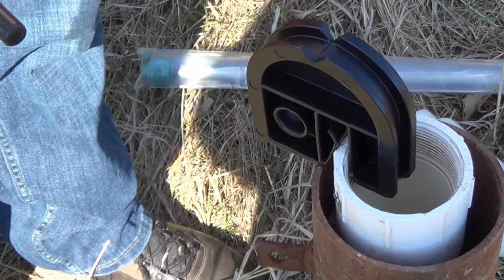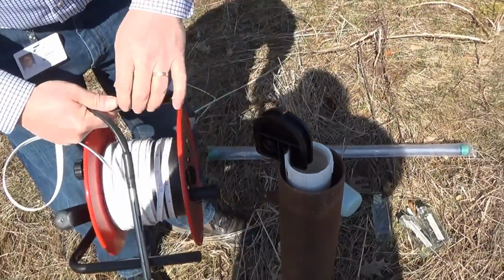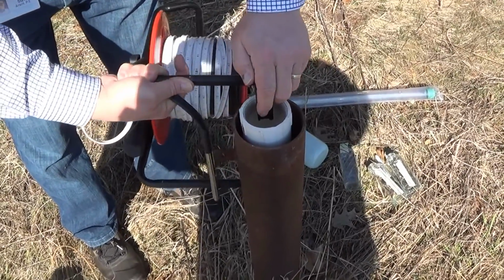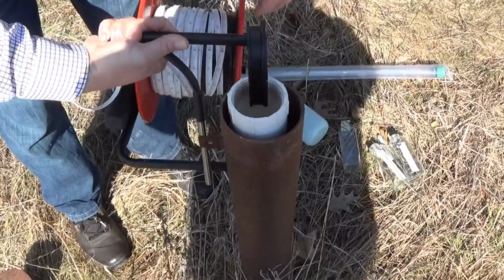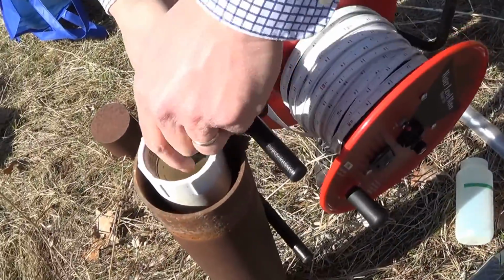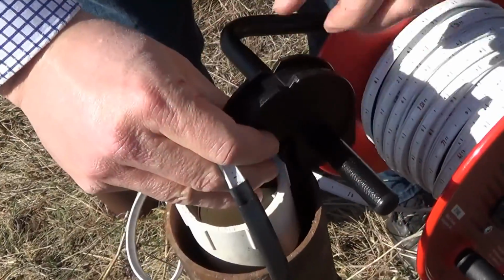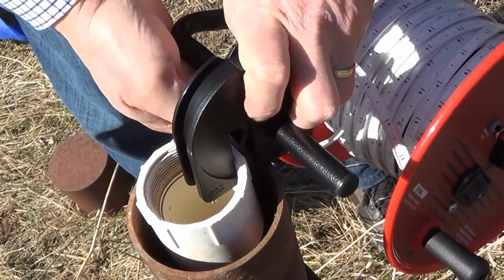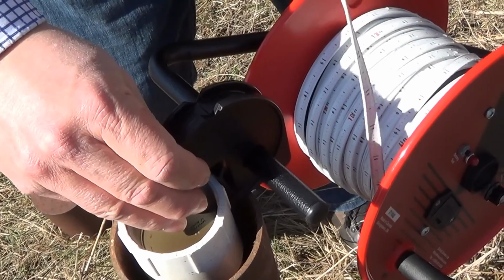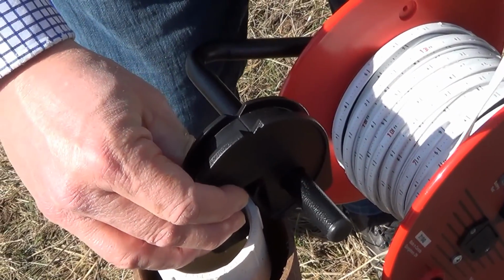Maybe we'll get it to work. Okay. And then we have a device, just a couple of holes here. You see that this gets inserted into the, yeah, it's not going to hold because we're not on the metal. But in general then what we do is we then string our tape right over this. If I can do it here.